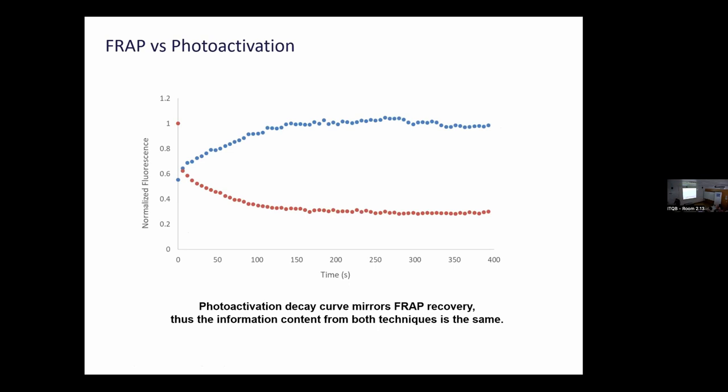All right. This is just a word of caution because there have been some studies, in particular some FRAP studies, where some quantitative parameters were estimated with wrong assumptions. And if you check the literature, there's hundreds, maybe thousands of papers with FRAP over the years. It's 40 years old, but still used a lot. It has had a tremendous impact, and it's still very used today. You'll see some of them where incorrect assumptions were made and led to some mistakes that had to be corrected later.